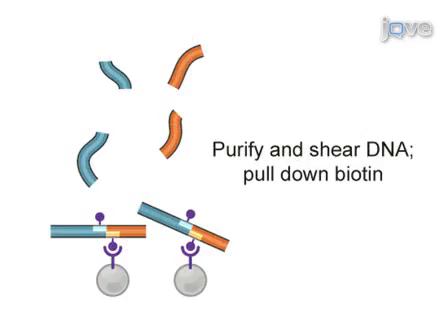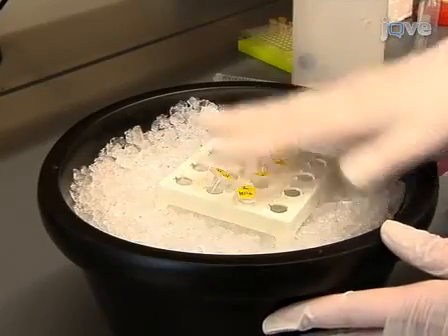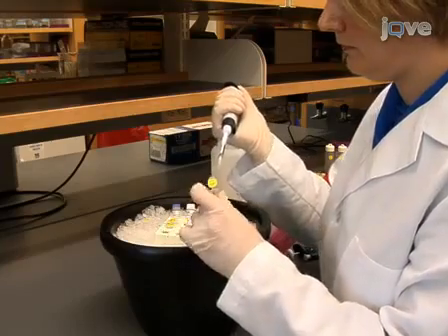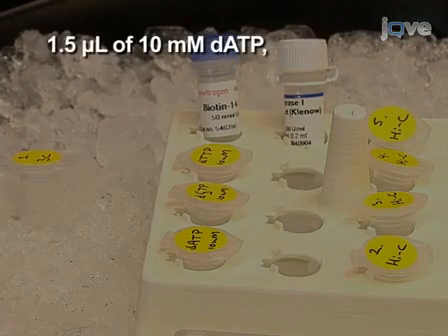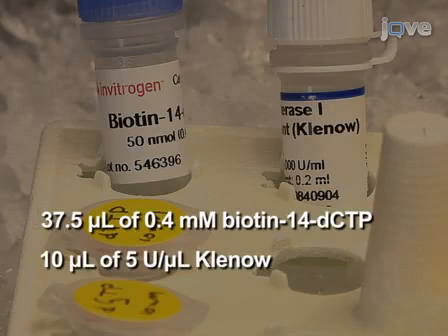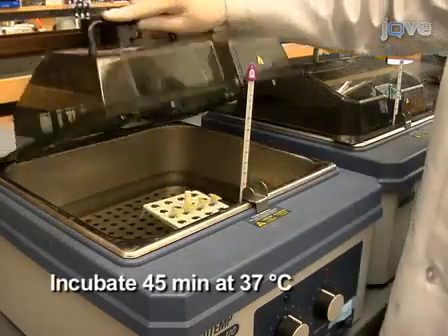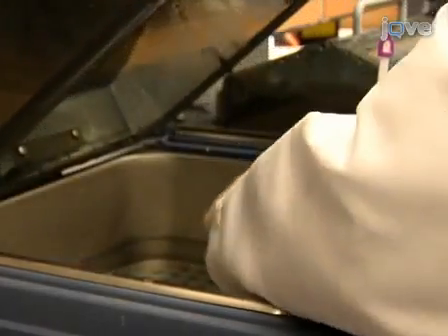Tube 1 should not undergo the biotinylation step and should instead serve as a 3C control to ensure that digestion and ligation conditions were optimal. To fill in the restriction fragment overhangs and mark the DNA ends with biotin in the remaining 4 tubes, add dATP, dGTP and dTTP to tubes 2 to 5. Also add biotin-labeled dCTP and Klenow. Mix carefully and incubate for 45 minutes at 37 degrees Celsius. Following incubation, place the tubes on ice.